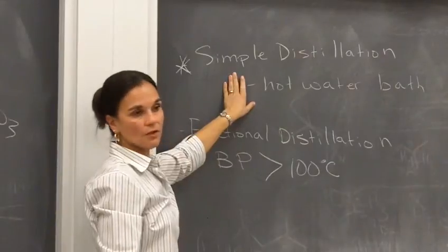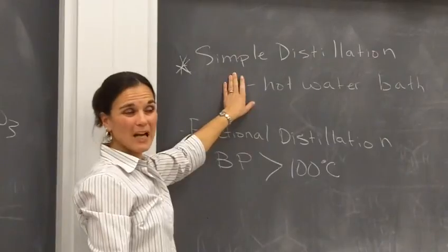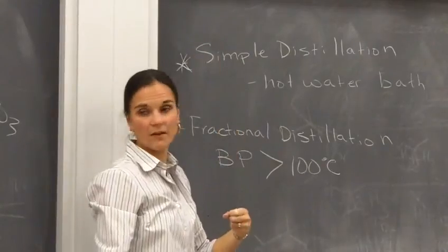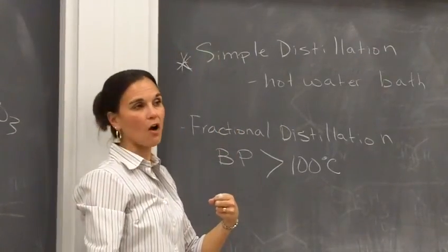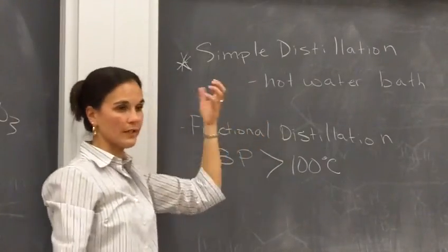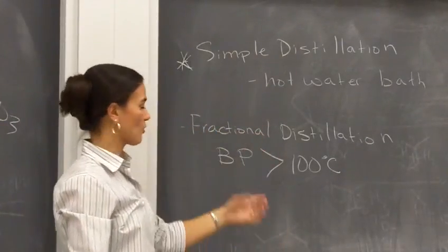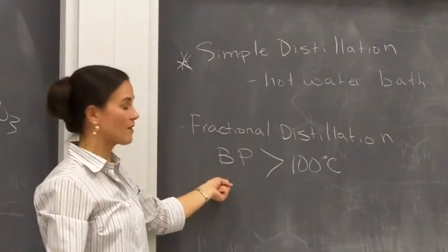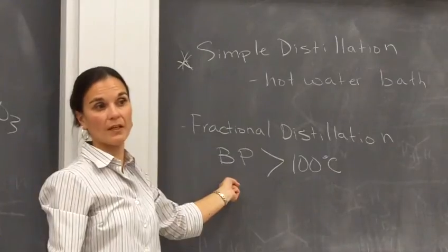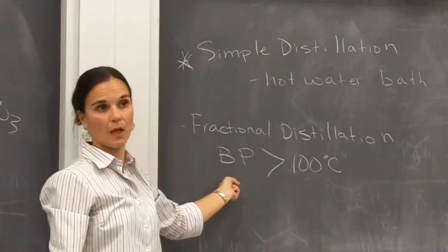After the simple distillation, you can store your product in a round bottom flask. Make sure you grease the stopper so it doesn't get seized, because there's still going to be ether in there that once it cools down is going to want to suck down on that stopper, and it'll be hard to get it off next week. Okay, so make sure there's a little bit of grease on your round bottom. You can store it in your round bottom flask in your drawer until next week, and then we can do this part. If you're very efficient this week and you get to this point, just make sure you double check with your lab prof as to what your boiling point is so that you are collecting your alcohol at the correct boiling point range, okay?